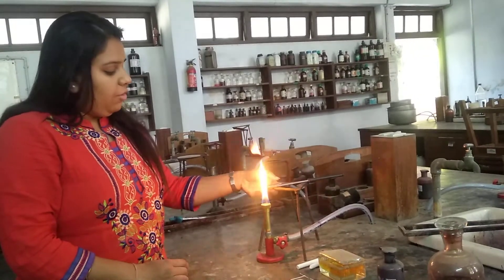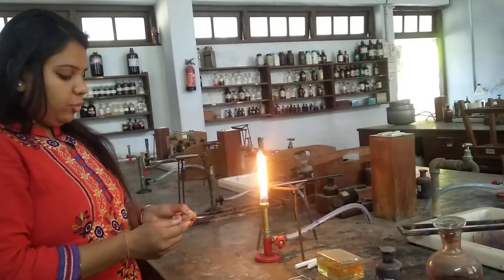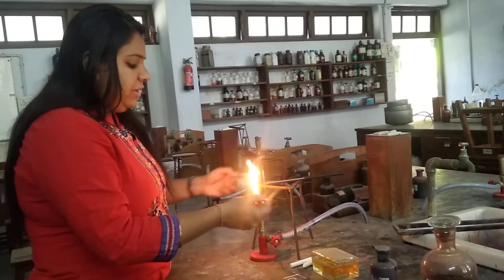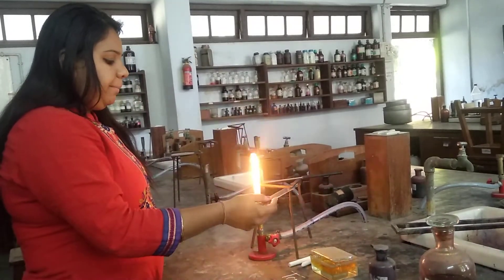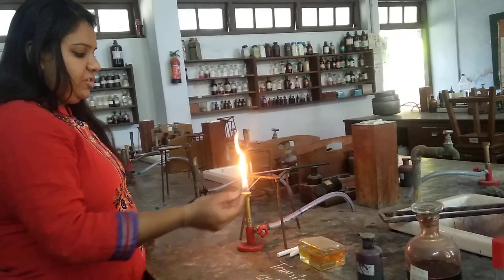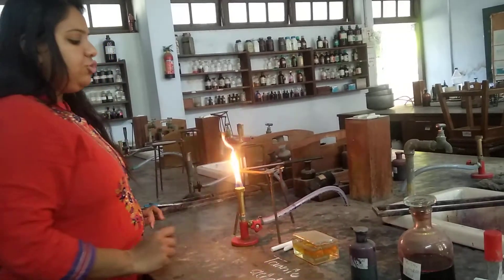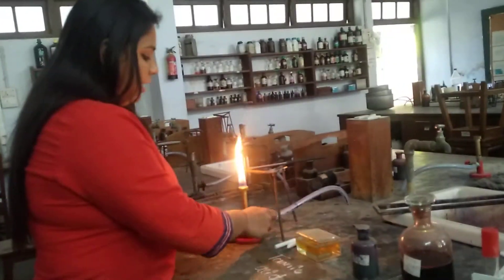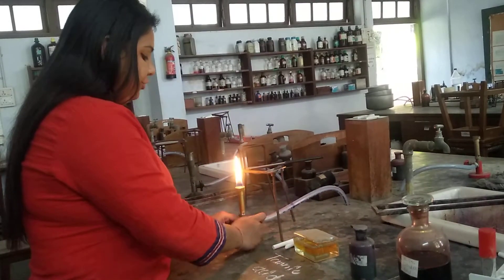Now, after waiting for 1 minute or so, we will heat fix the smear. For heat fixing, we will gently pass the slide 2-3 times over the burner so that it gets heat fixed. After heat fixing, we will allow it to cool at room temperature. Now we do not require the burner, so we will put off the burner.